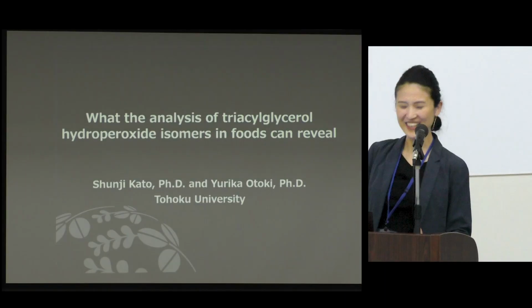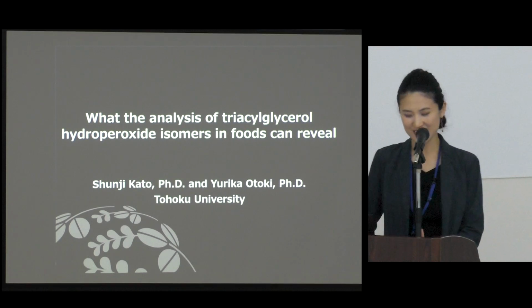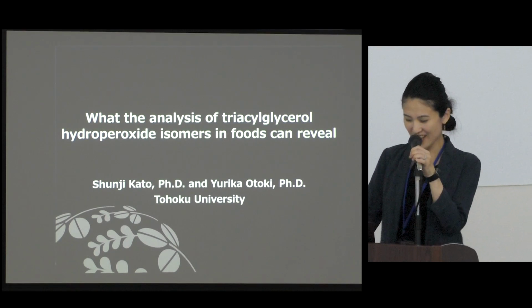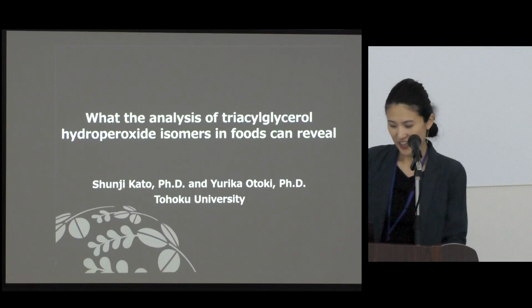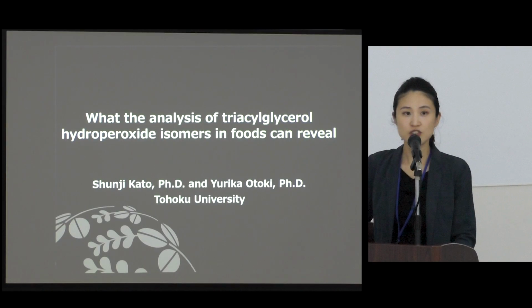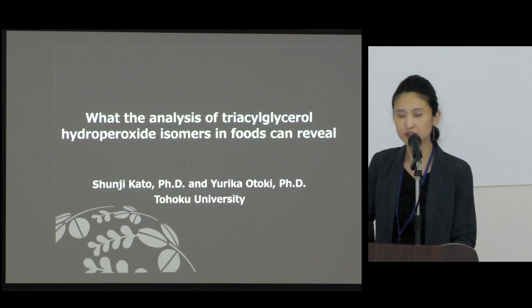Okay, so today's topic is triacylglycerol hydroperoxide analysis. Which is not a plant topic, but as you know, triacylglycerol is the main component of food lipid, and the prevention of its oxidation is very important to maintain food quality and safety.